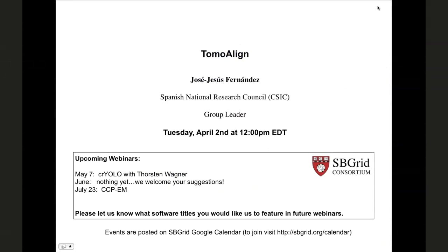The 12 angstrom to 9 angstrom resolution gain is pretty impressive. I think you can see obvious improvements there right off the bat. I had one very general question. As you get these high quality models of the vector fields of motion distribution along with different samples, do you have any generalizable conclusions from what you see around certain types of collection geometries or different microscopes? Are there things that you can use to build better models?